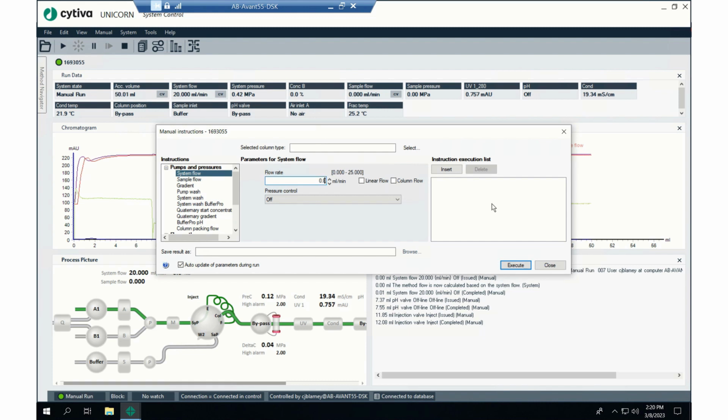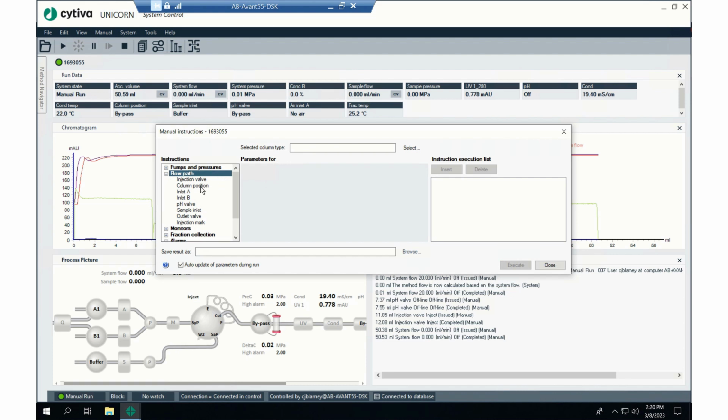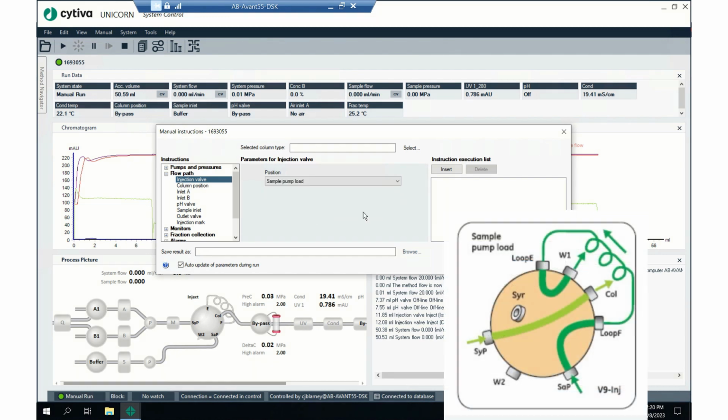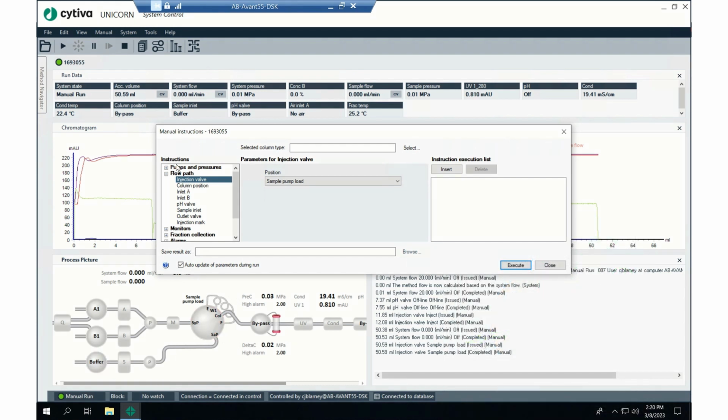So we'll make that 0. All right, now we're going to change the injection valve position too, and we're going to use a new position we've never used before. We're going to do sample pump load, and I'll put the flow path of the injection valve for the sample pump load right here so you can see how it works. Execute, and we're going to use the sample pump now to push the sample up into the super loop. And so I'll turn it on here and you'll see it right here on the flow path.